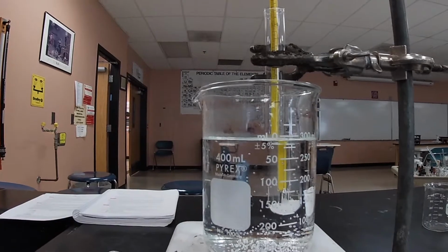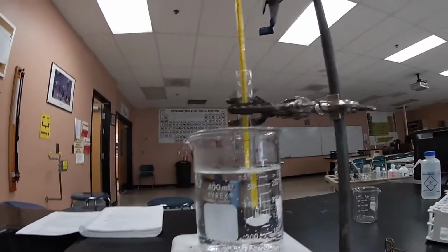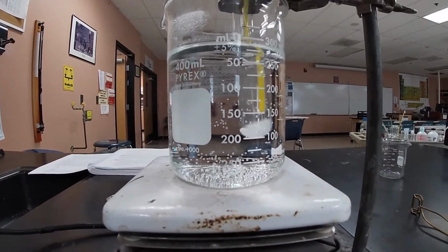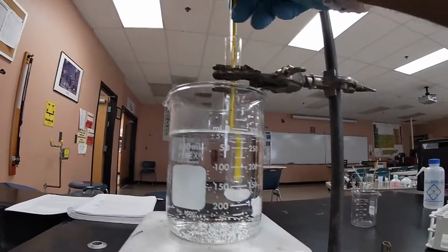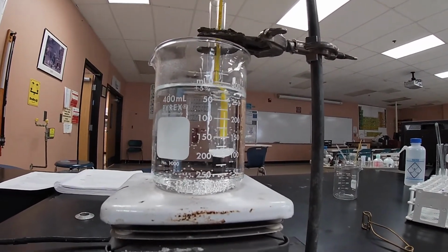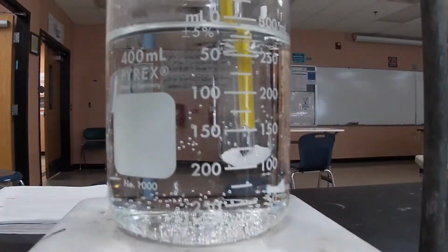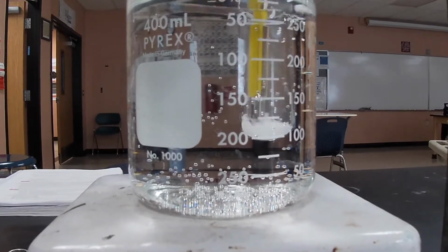Let's zoom out a little bit. And so as you can see, all I'm doing is stirring, and you can see a lot of it is dissolving. But I gotta continue. I did increase the heat a little bit. We're at about 5.5 to 6. And hopefully you can see that some of it is dissolving. Let's go ahead and, come on, there you go. So you can actually see it dissolve. Hopefully you can see what I see.